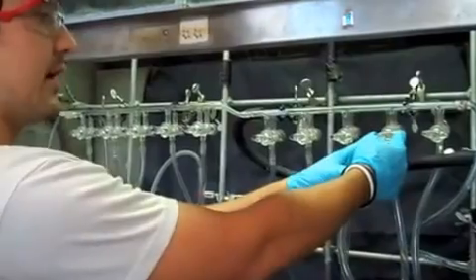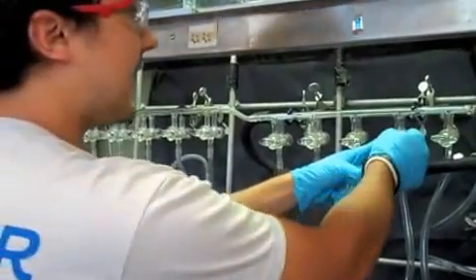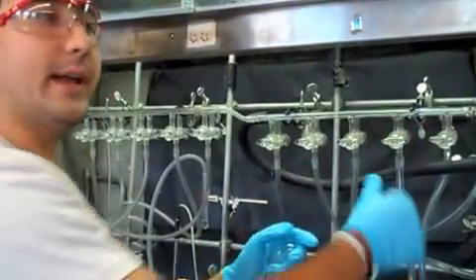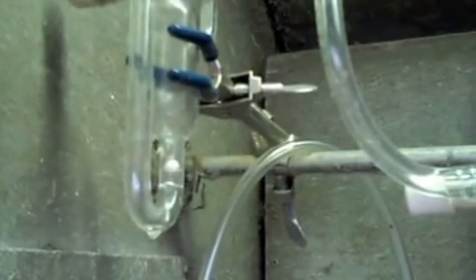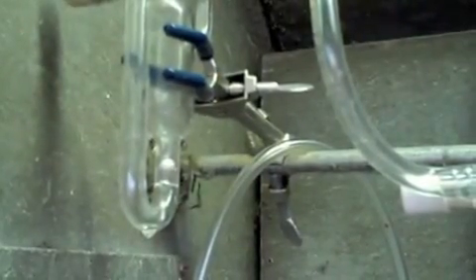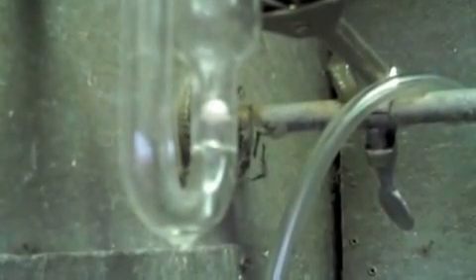Since you can switch between them, you can check the two sides. One side has a blue dot and one side doesn't. Blue dot down means vacuum and blue dot up means nitrogen. So that's the bubbler. If you have nitrogen running through the lines, it'll end up running through here, and you can check to see if there's nitrogen flow based on the bubbling of the oil right there. As Jonathan mentioned, it's easy to switch between nitrogen and vacuum, and this is often a good technique for purging.